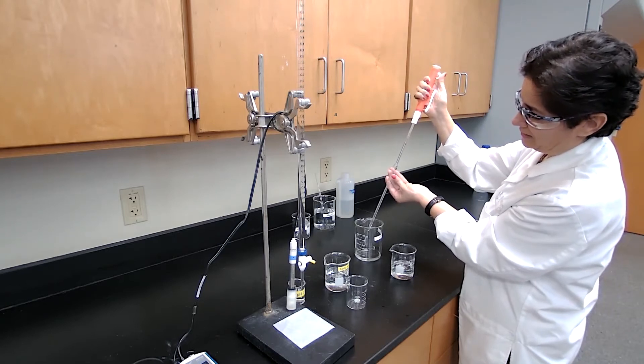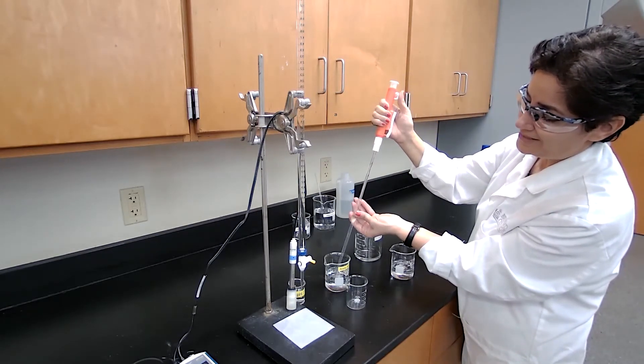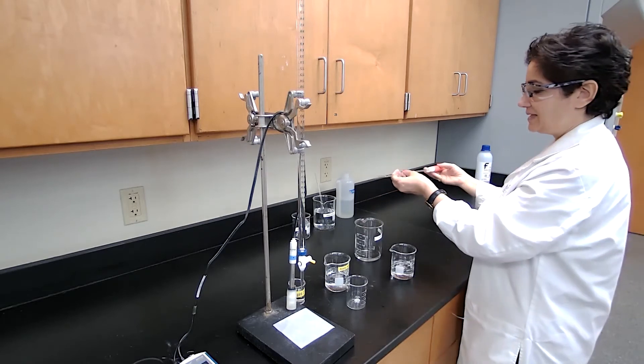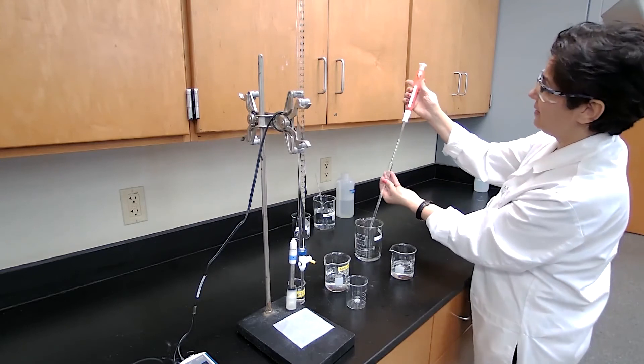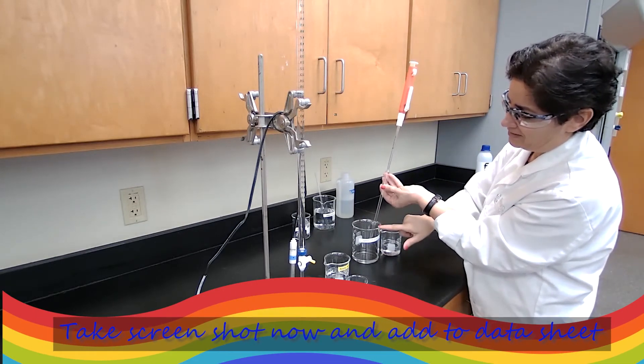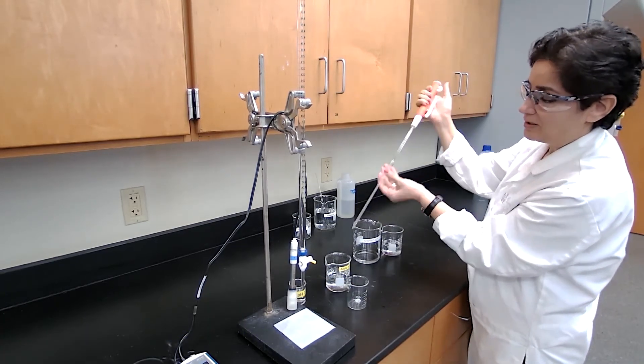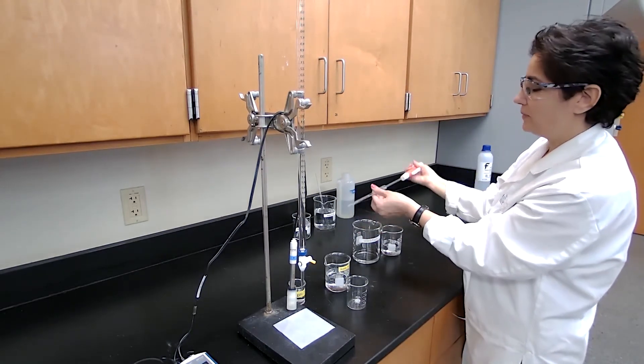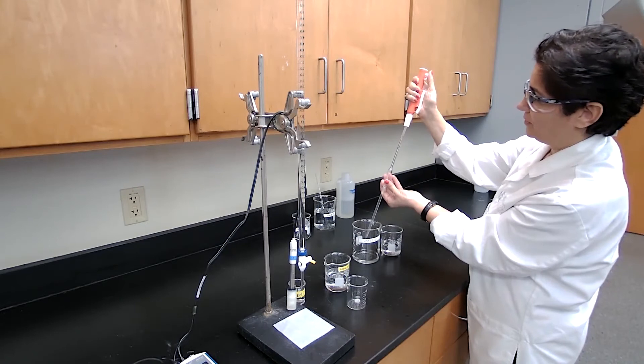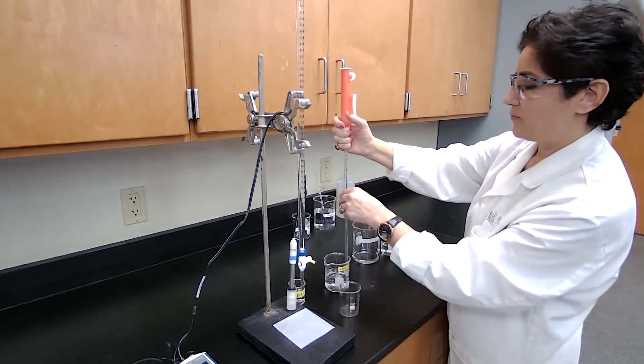Once I wash it with distilled water, then I would wash it with the solution I want to fill. So I take some acetic acid, I'm going to rotate it, and make sure that the inside wall of the pipette is cleaned with the acetic acid solution that I want to fill. Discard into the waste container. So I have my deionized water, I have waste container, and here is the acetic acid. It's safe and better procedure if you repeat this washing a couple of times to make sure that the burette and the pipette is clean. Same thing for burette. Conditioning the burette I showed you already earlier.